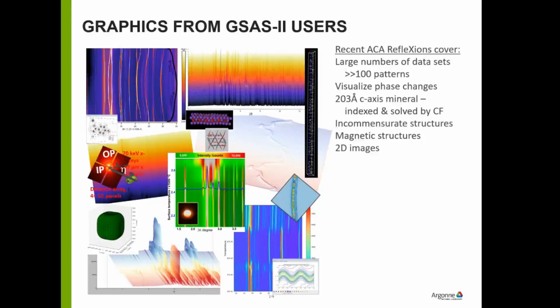This thing is a mineral found in New Jersey, which is, it's all in there. Basically, it's a laundry list of elements. Principal things are arsenic, manganese, magnesium, a little bit of iron, oxygen, of course, that sort of stuff. The unit cell for it is 8 by 8 by 203. Ridiculous.